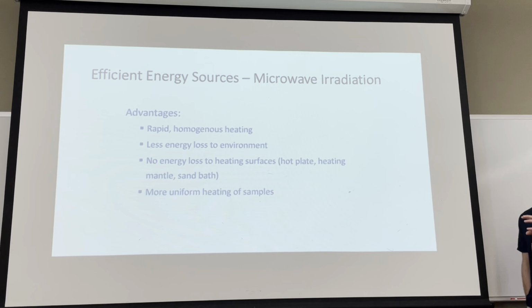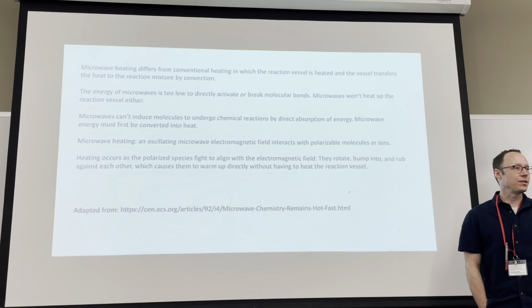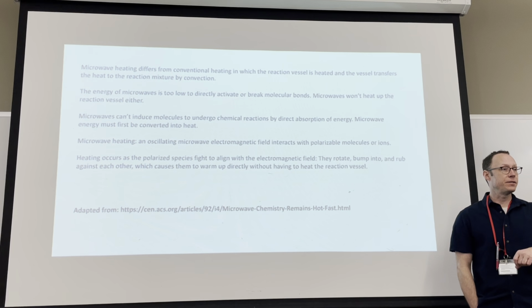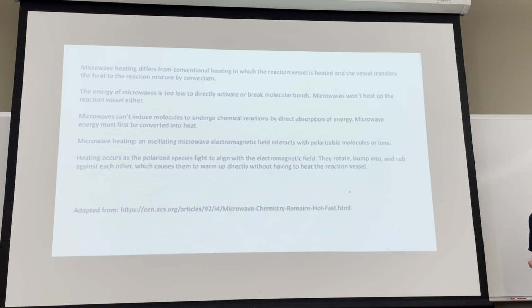So as I said, there's a few advantages to using the microwaves. The microwave is a direct heating method. Whereas the traditional heating methods are indirect, they heat by convection, so you have to transfer heat from the heating mantle through the glass, through the solvent, etc. So it's an indirect heating method, and a fairly long one. It takes a while from the time you heat your mantle to the time you're actually refluxing, right? Microwaves are much faster and a direct method of heating.